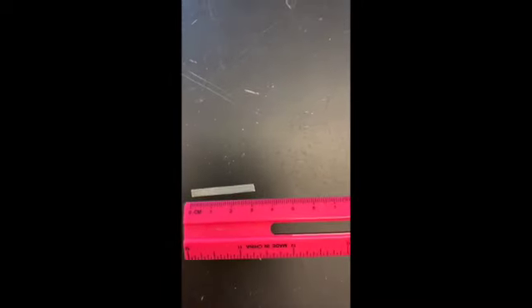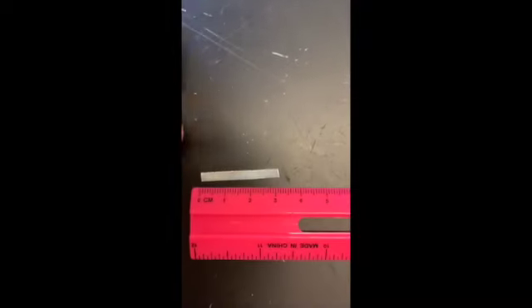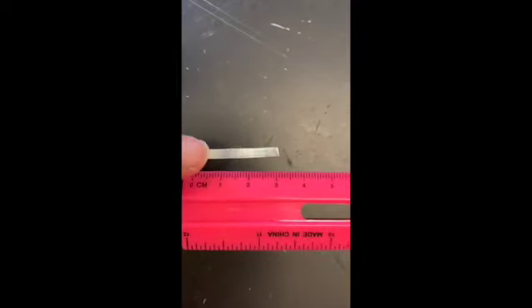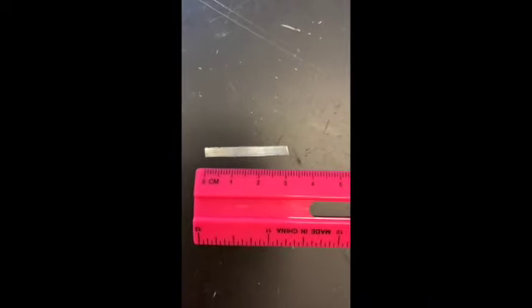Okay, great. All right, hi guys. So for reaction number 1, you need a length of magnesium metal. And so this is our piece of magnesium metal. I'm having it lined up to the 0 as much as I can. So you need to take the length of that and record it.